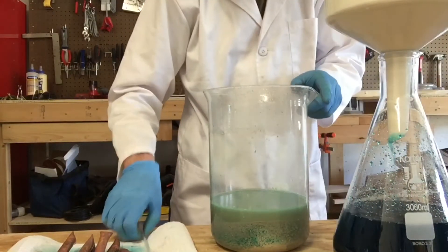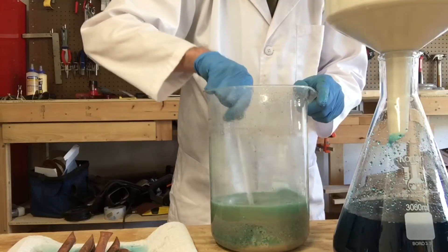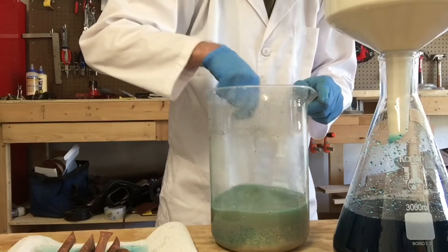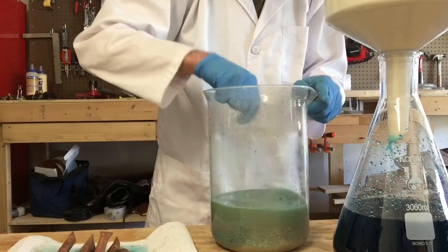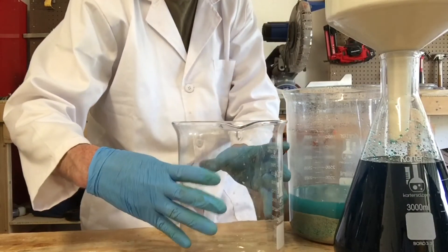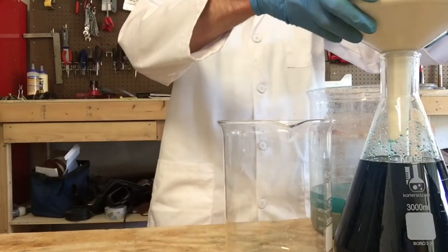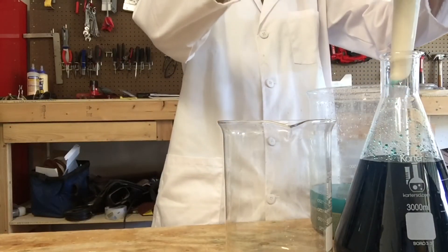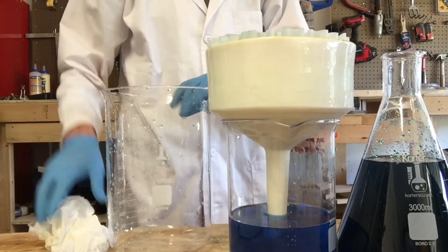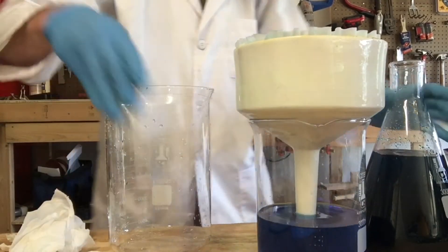I diluted my liquid a little bit. We're going to try to get some of that green copper color that's sticking to the silver cleaned up real nice. We're getting kind of full so I'm going to move my Buchner funnel over and get this finished up. I just cleaned up my large beaker with distilled water and poured this back in.